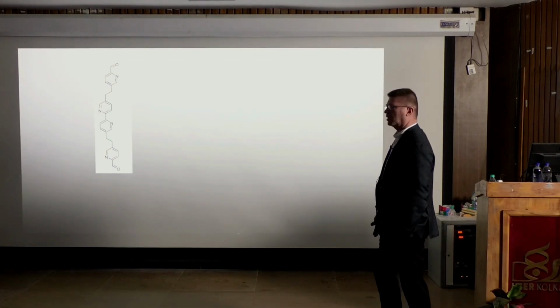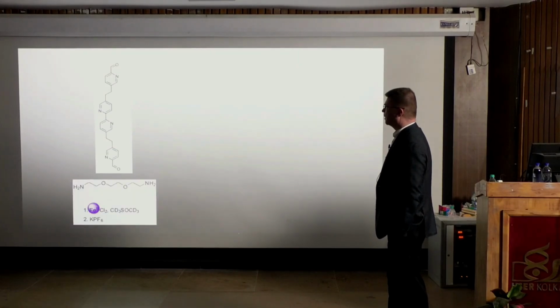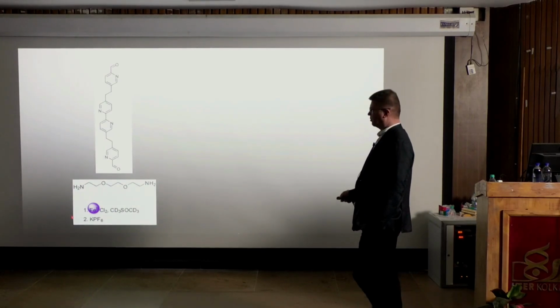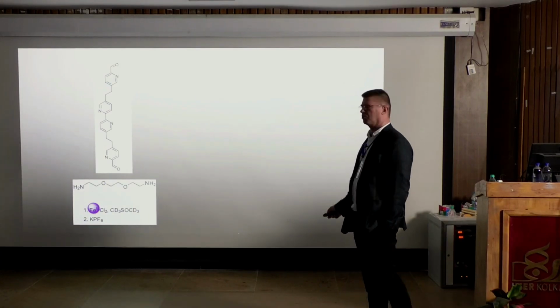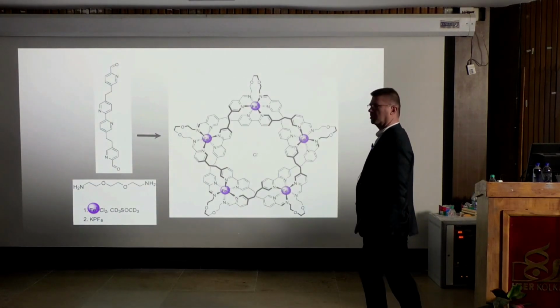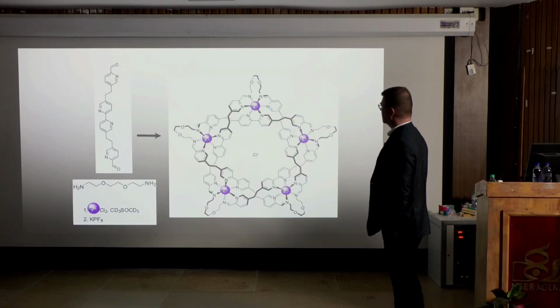Now, the actual idea of the chemistry is very simple, or not. So you have to synthesize this, and then you have to take the connector point, which is this kind of ethylene glycol-based diamine. Then you again have iron in there, and then later on you will do an anion exchange for this to get it crystalline. And this is actually the molecule. This is the knot. This is how it goes.